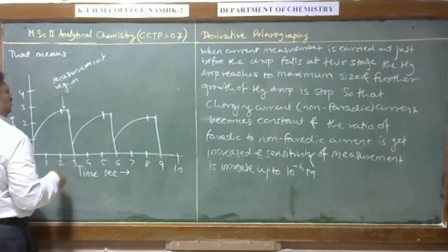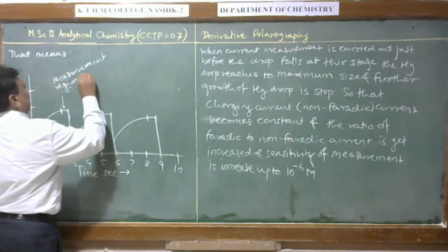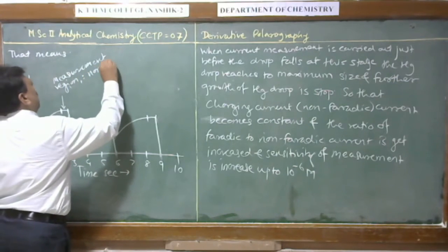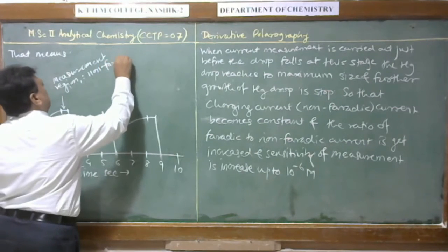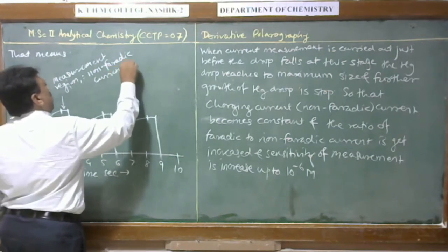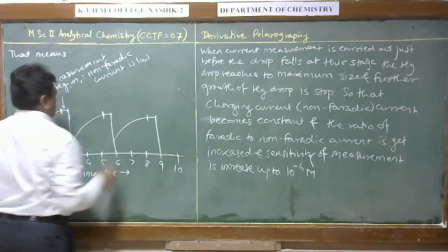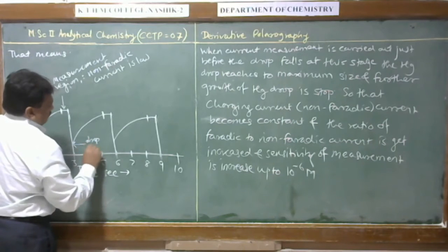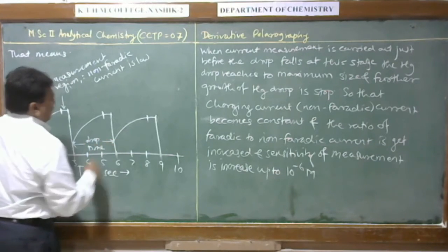In this region the non-faradic current is low. This is the drop time, in seconds.